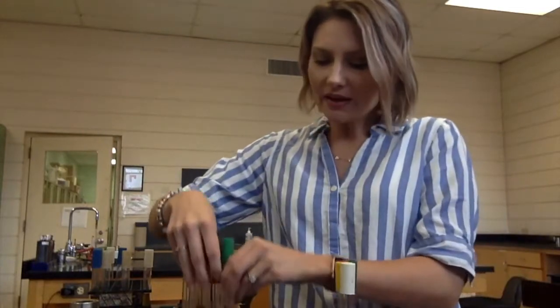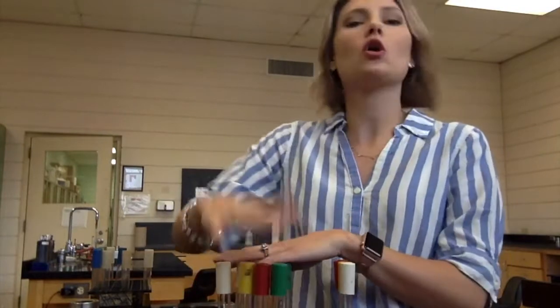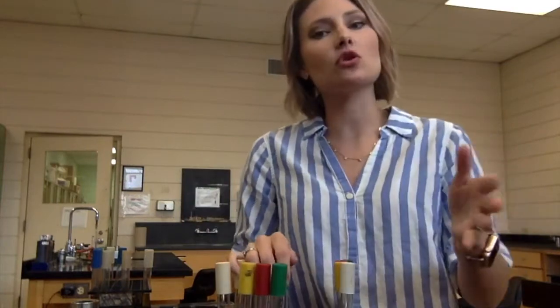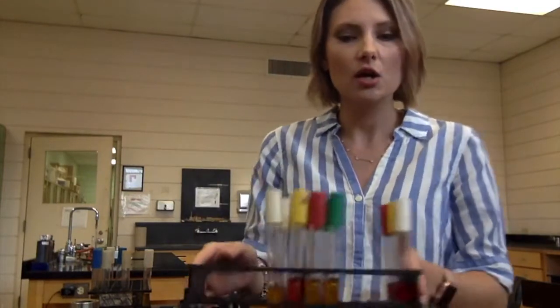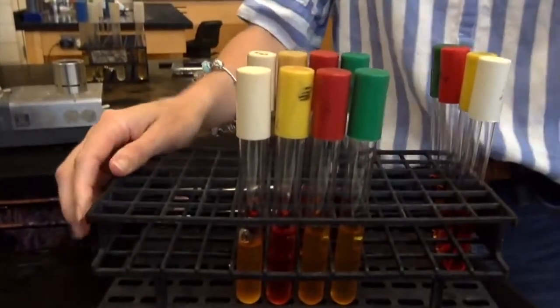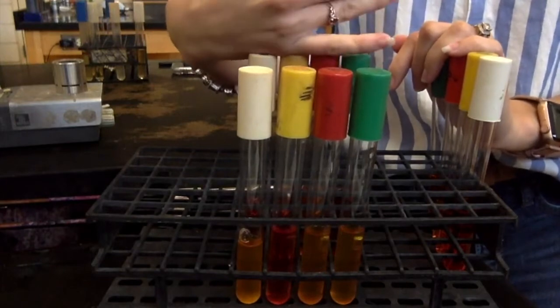Now, I inoculated 2 different ones. I did E. coli and I did Pseudomonas. E. coli being the fermenter, Pseudomonas being the non-fermenter. That way you get to see what a positive result looks like and what a negative result looks like. So let's go over the results and what they look like. So here's my E. coli set of tubes. My Pseudomonas is in the back. I'll show you those in a minute.